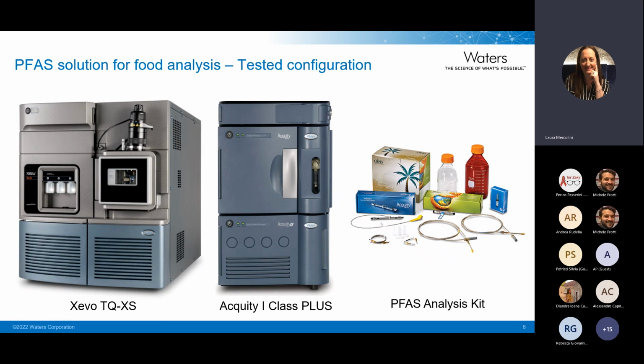For this reason, we started to develop a method based on our knowledge developed in the past for environmental samples. We decided to use a high-end triple quad, the Xevo TQ-XS, to reach this level of quantification. We use a triple quad coupled with a UPLC class system, and it is mandatory for this kind of analysis to equip the system with the PFAS kit in order to eliminate any background contamination of PFAS.